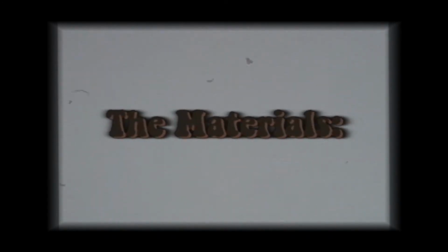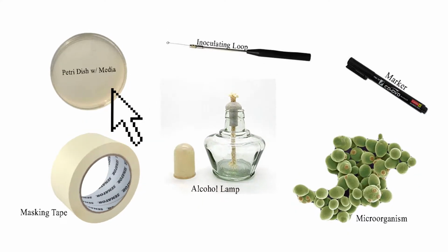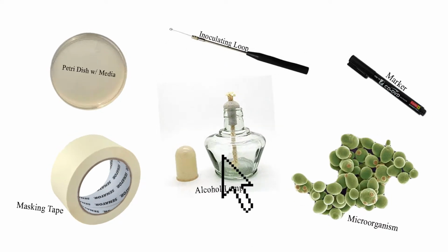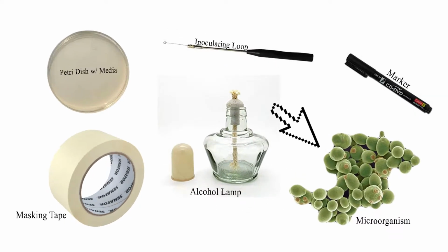To start, the materials required for this are petri dish with appropriate bacterial media, inoculating loop, Bunsen burner or alcohol lamp, marker, masking tape, and your chosen microorganism. We will execute the aseptic technique first by preparing a safe and sterile workplace.